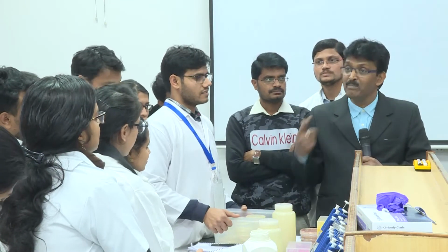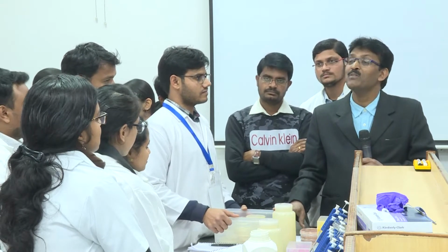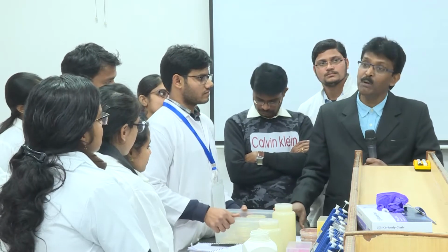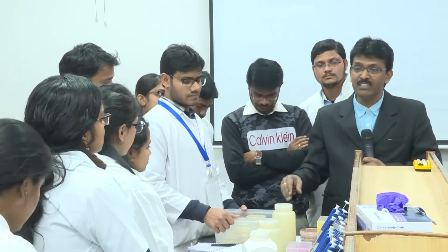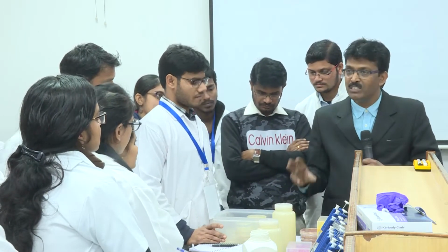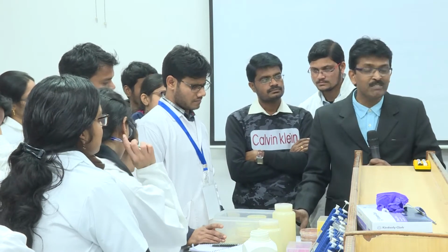Remelting, you have to again melt it. Melting again means what? The nutrient composition will be different. Chemical composition is bound to change. With repeated heating and using, you are not giving the media the way it is expected or the way it is found in the literature.